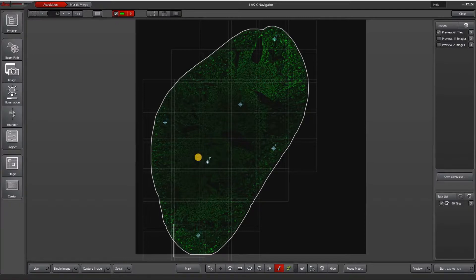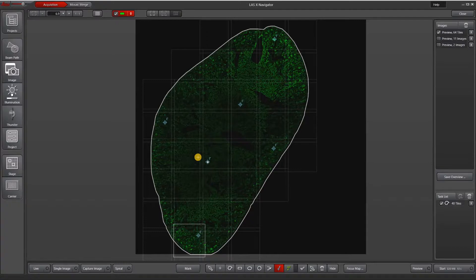The more focus map points you have, the more precise the focus map will be. However, it doesn't make sense to do more than one focus map position per tile. It also is time consuming to set up all of those focus map points.